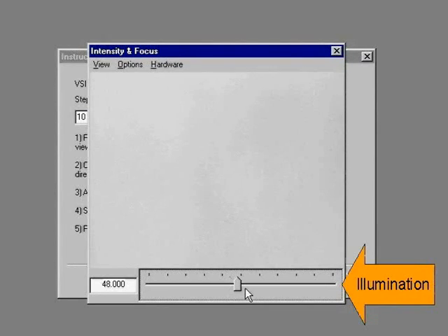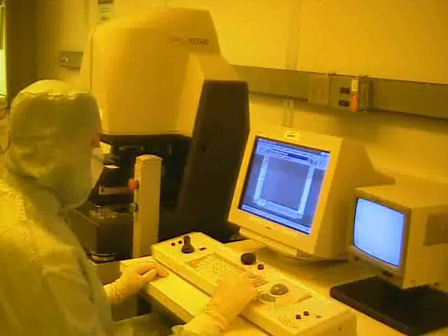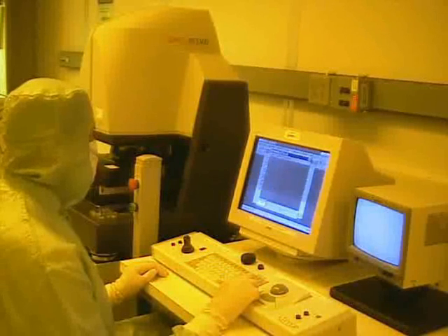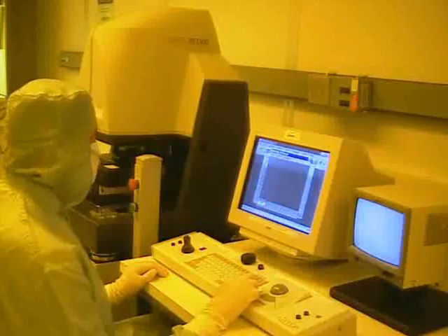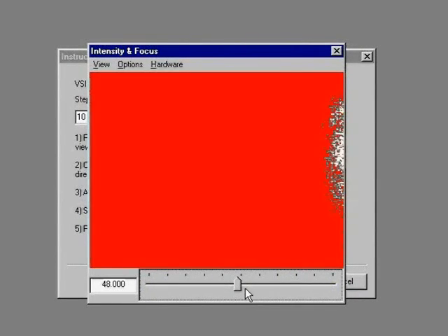This slider controls the illumination. It can also be controlled by the page up and page down keys on the keyboard. Pressing page down will increase the illumination and pressing page up will decrease the illumination. We increase the illumination until we see red in the screen, then we will decrease the illumination until the red is eliminated.